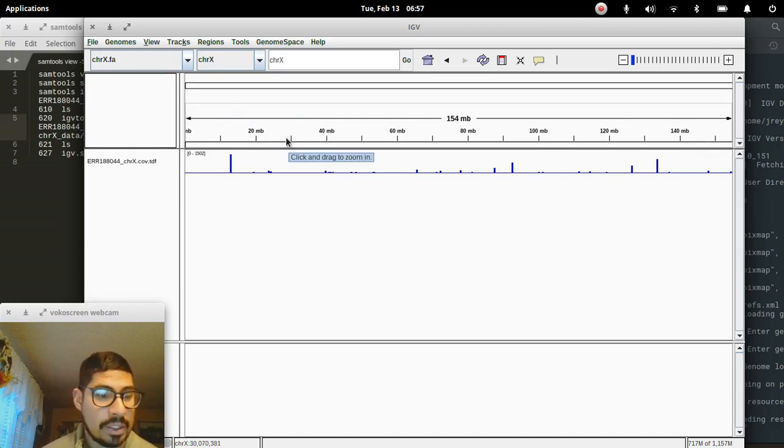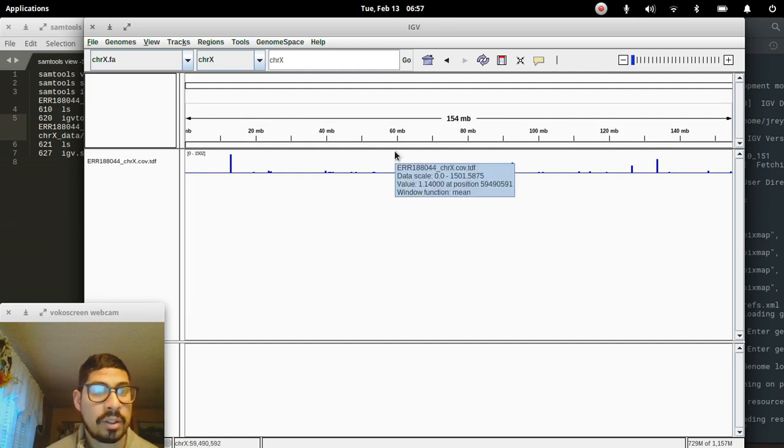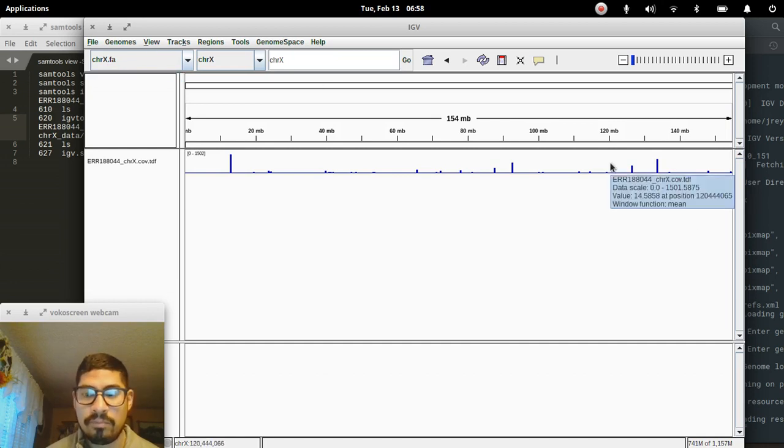Thank you very much. And like I said, this was converting our SAM file to a BAM file, making an indexed file to accompany it, a bam.bai file, introducing our genome so that we can make our TDF file. And once we have our TDF file, see it inputs right here. It's able to call it through the program, and then we get to visualize the TDF itself.